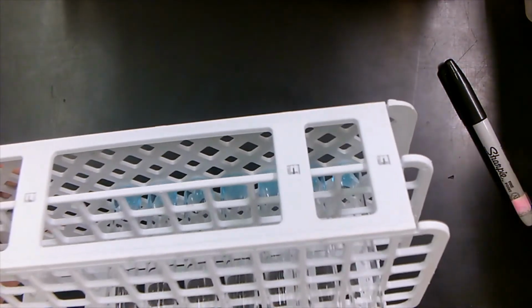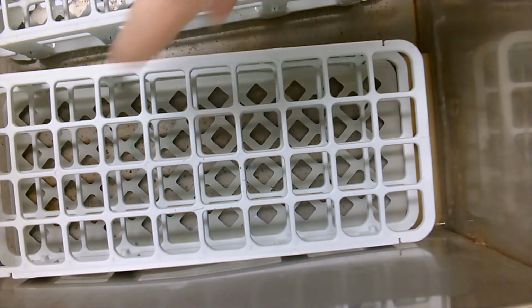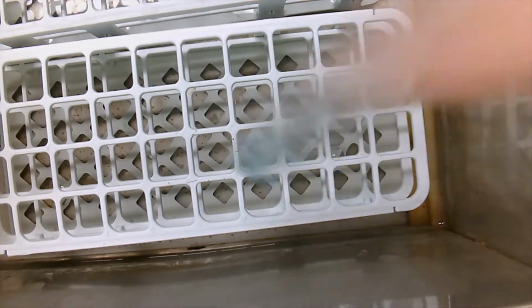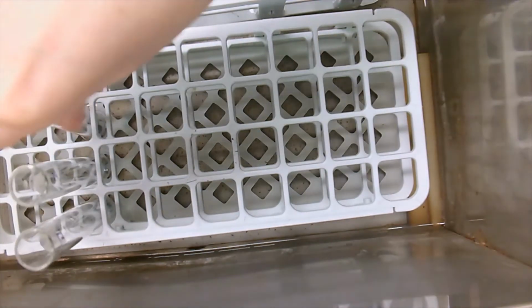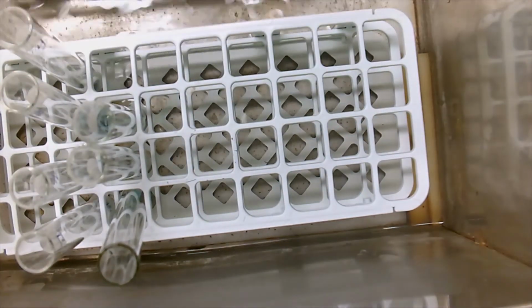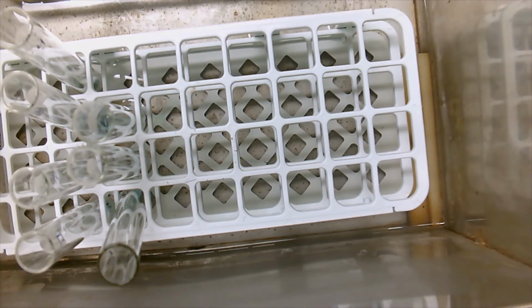And now we're going to be putting them in our water bath, also known as our test tube jacuzzi. So let's put them in the water bath. This is our water bath right here. We have our water here. We have our test tube rack in the water, and we're putting our test tubes in the water. We'll make sure that the water covers our test tubes. Okay, so we're going to leave them in here for at least 5 minutes. So we're coming back.